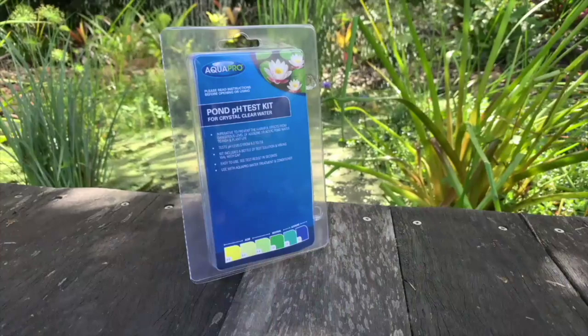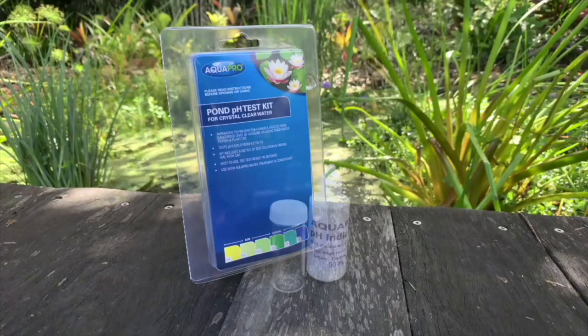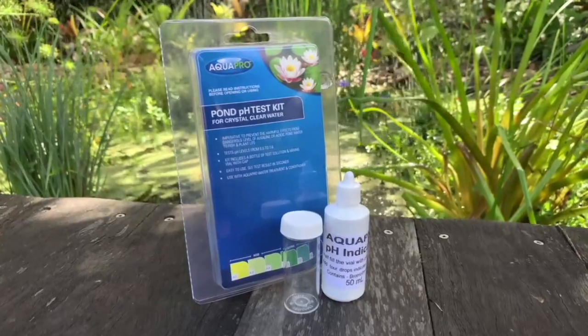So how do you test your pond water? Well, it's as simple as testing the pH in a swimming pool. The AquaPro pH test kit is a simple pack containing pH indicator solution, a test bottle and indicator card.